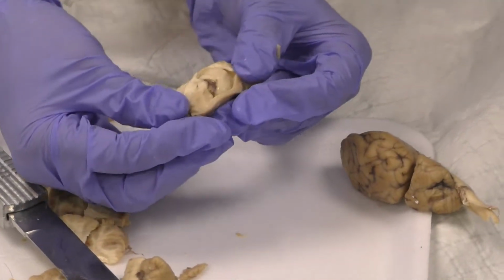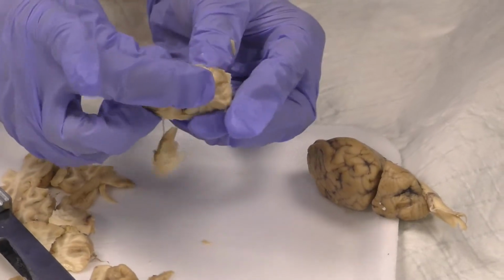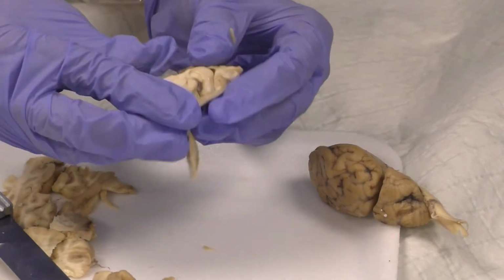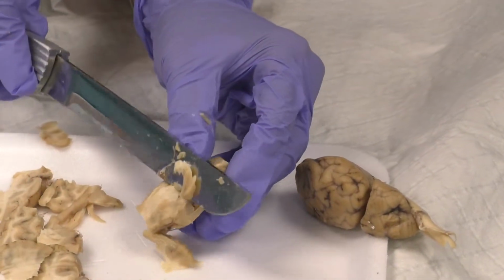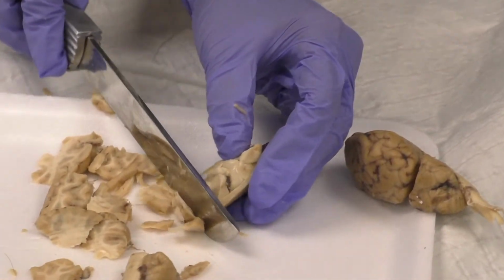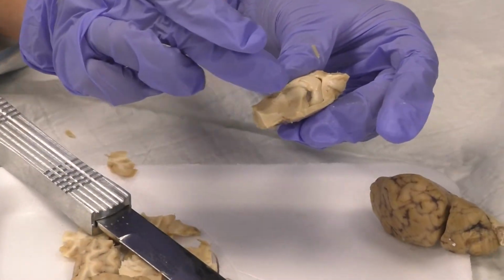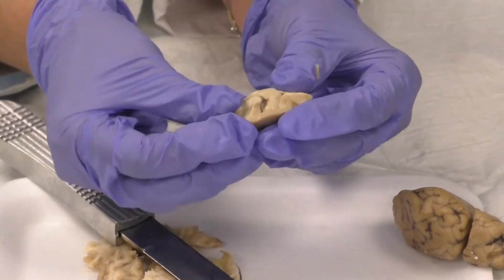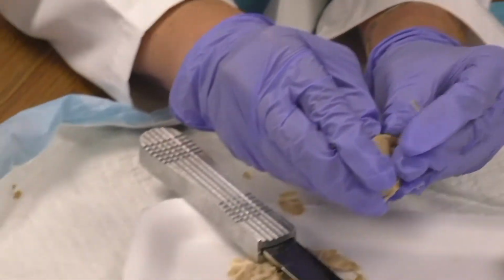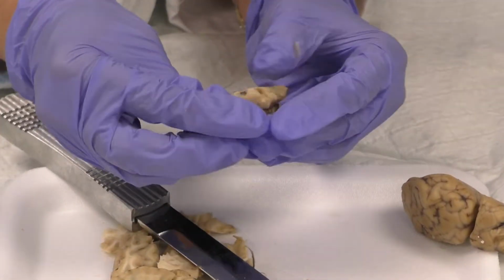There, that's the whole C, from there to there. And you can see this is turning into the fornix. It goes down like that. So I could take more off right here. So the amygdala would be right here. It's hard to see the amygdala. The amygdala doesn't have the same kind of structural integrity that the hippocampus does. But you can peel the garlic clove even more and take it out.